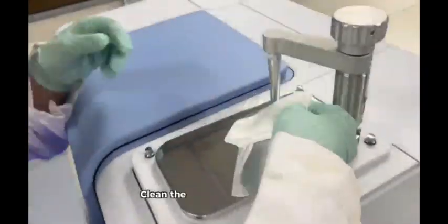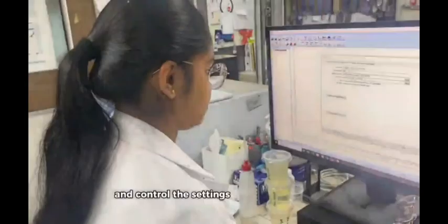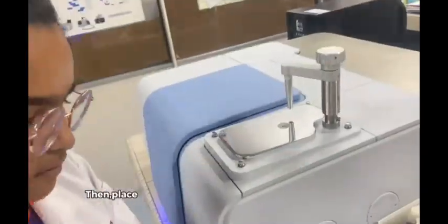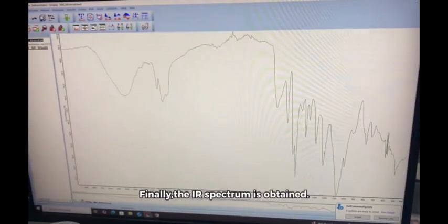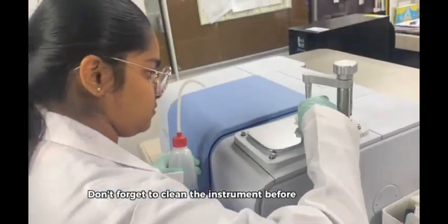Prepare the sample by crushing it into powder. Clean the instrument with acetone, then control the settings using Opus software. Then place the sample in the holder and scan the sample. Finally, the IR spectrum is obtained. Don't forget to clean the instrument before the next use.